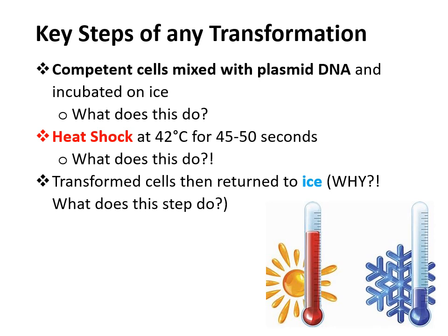And when I'm saying pores, that's P-O-R-E-S, okay, pores. So you want to first do heat shock to force the DNA into the bacteria, you then return it to ice quickly to close up the pores and keep the DNA in the bacterial cell.